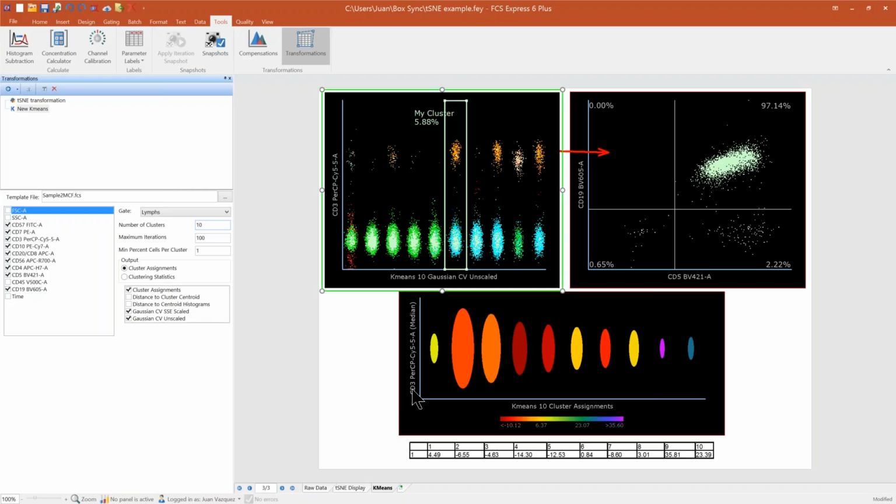We can look at an X parameter plus a statistic for that parameter, and then we can apply coloring to that. And then we can also use a lot of the new enhancements that we've enabled for our heat maps, such as the dynamic wells radius to see how these wells or these clusters relate to one another, which wells have either the highest number of events or a particular stat for which you want to compare for that well radius.